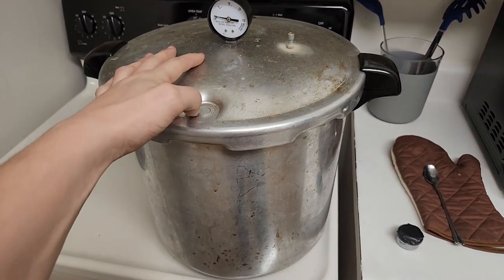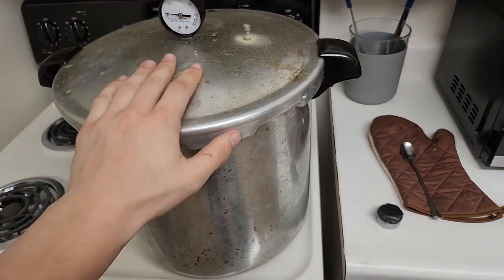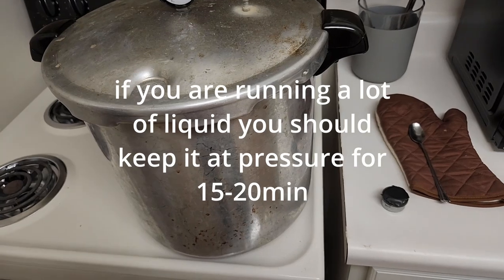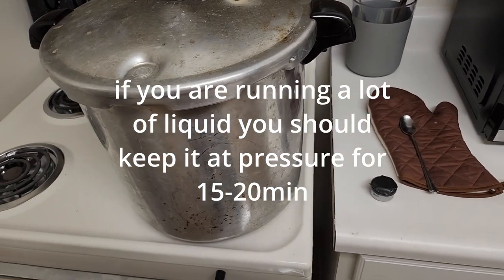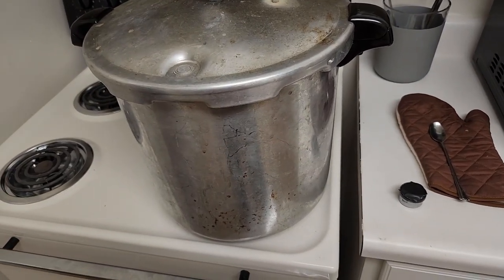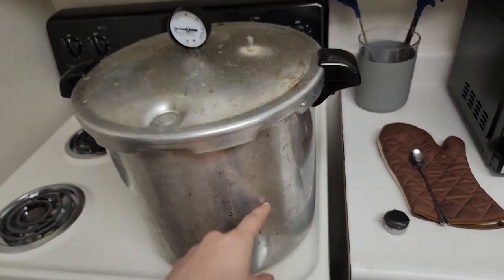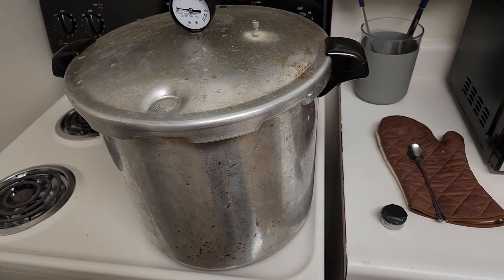In the past, I've said I let it sit there for like an hour. Completely unnecessary if you're only running liquids, but you want to make sure that they do get to temperature to properly sterilize. So I do like to overshoot 15 PSI a little bit, and the 15 minute purge is pretty important.